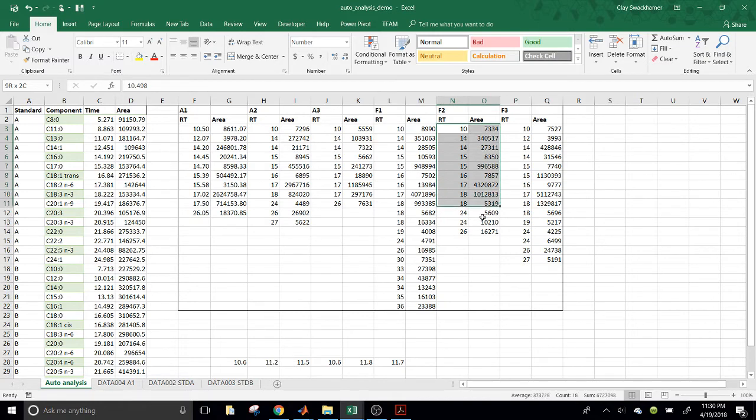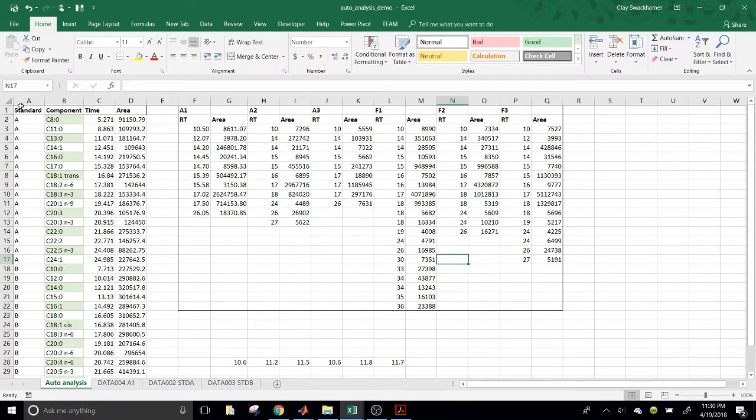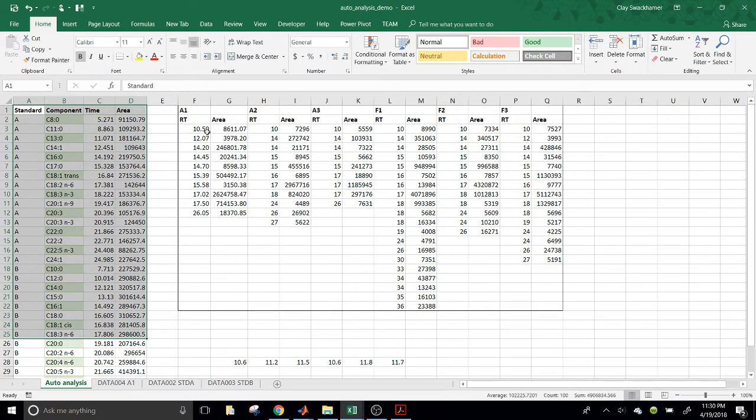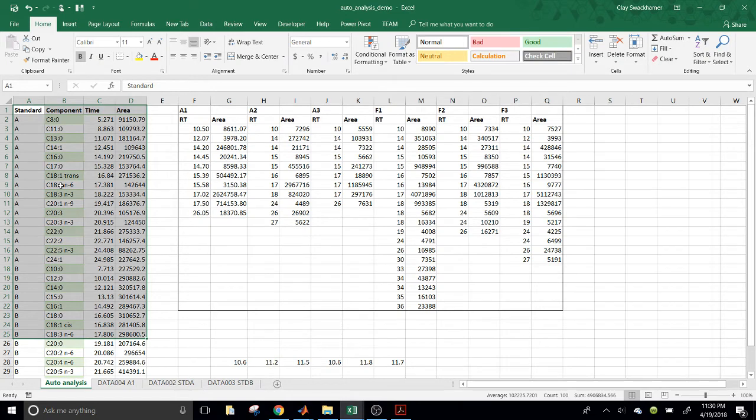So, anyway, we have that data for all six of these samples. Now, what we really want to do is generate a table that has all of this information, and then for each one of these experimental samples, it should have the retention time and the area of a peak matched to the closest peak over here.